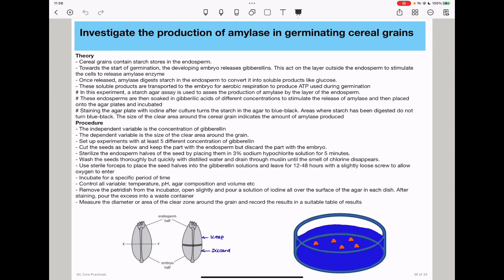Open slightly and pour iodine solution to cover the whole surface of the agar in each dish. After staining, pour away the excess. Measure the diameter or find the area of the clear zone around the grain and record the results in a suitable table.